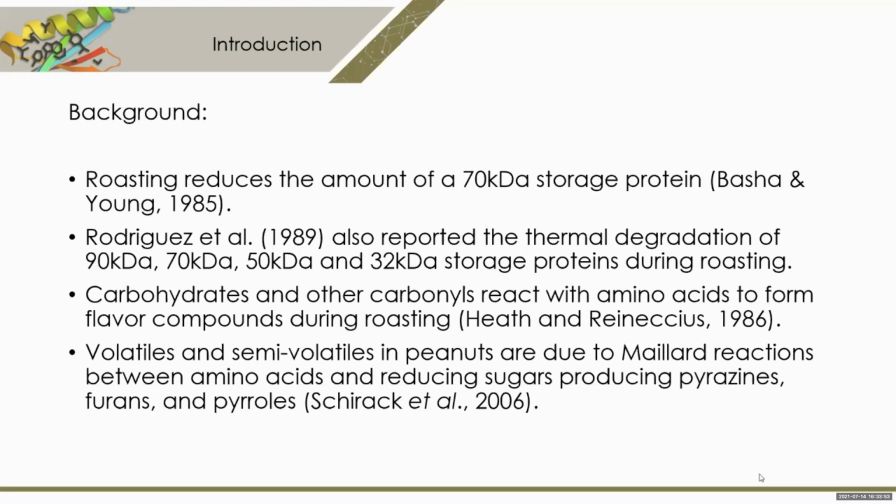To better understand the roasting process and generation of flavors, this project sought to identify the specific amino acids and peptides that react with sugar and quantify them. Also, we thought we could find the specific protein precursors that serve as the raw materials, sequence them, and identify them. Proteomics was selected as a potential analytical tool to do that.